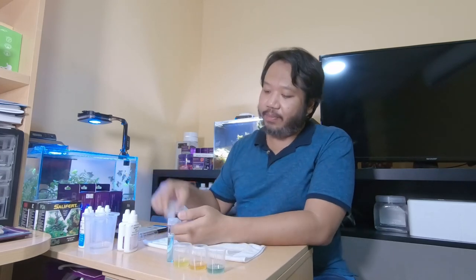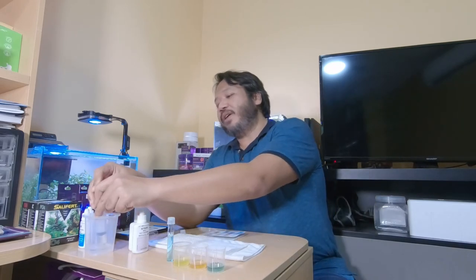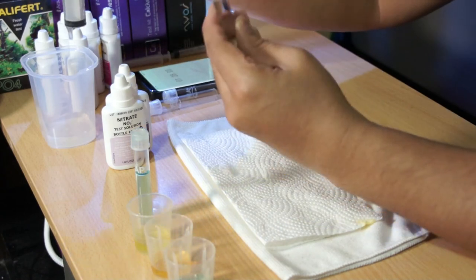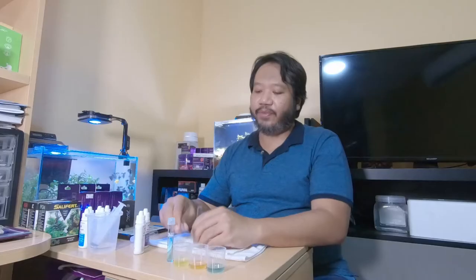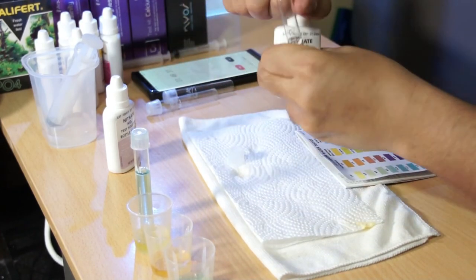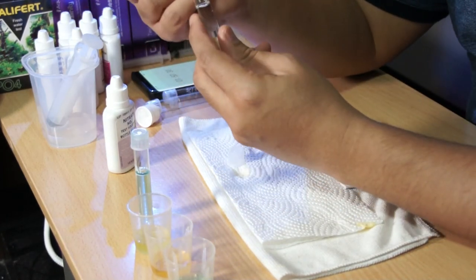Nitrate is the most challenging test because there are several things to remember. I always dread it, but it's the most important test for this tank — I'm certain this overstocked tank is full of nitrates. That's why I do the nitrate test constantly and do water changes every two days. Same procedure: 5 ml of water. First, add 10 drops of bottle 1. The bottles are child-resistant so kids can't open and drink them.